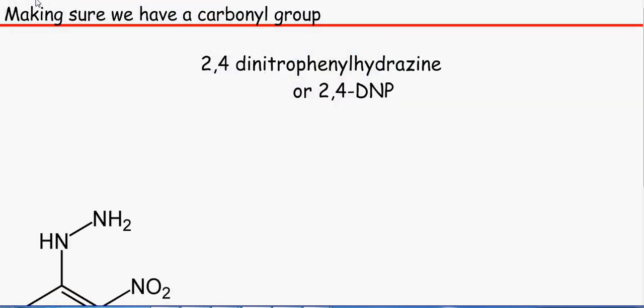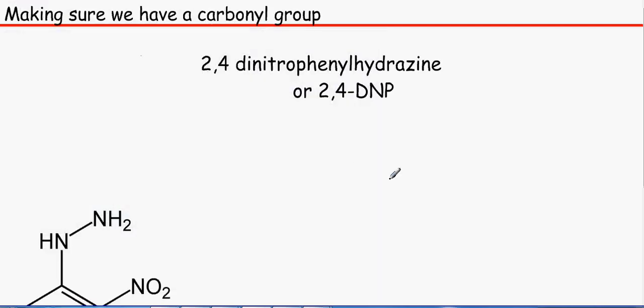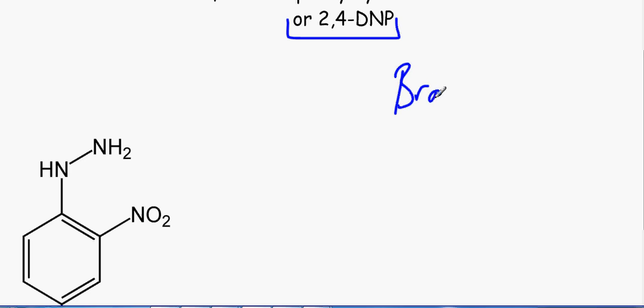So the next test we want to do is just to make sure we actually do have a carbonyl group in the test tubes. Because we have oxidised it to make a carbonyl. So we just need to check that we have carbonyl groups because alcohols do make carbonyl groups. And we use 2,4-dinitrophenyl hydrazine or 2,4-DNP, which looks like this.